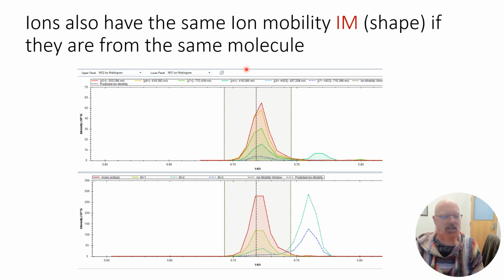And I have another presentation on this, but ion mobility is basically, think of it as a wind tunnel, even though lots of different ion mobilities work a little differently. This is called trapped ion mobility. So peptides that have the same mass can have a different shape. For example, two different isomers or isoforms of a peptide that have PTMs on different amino acids.